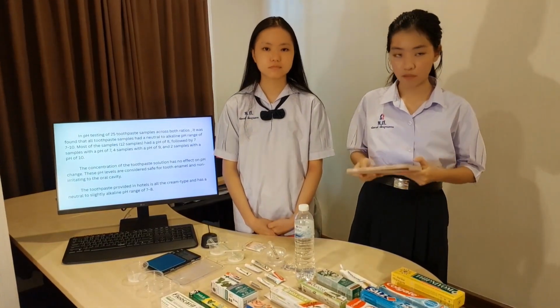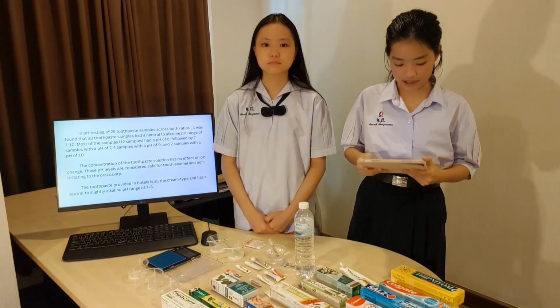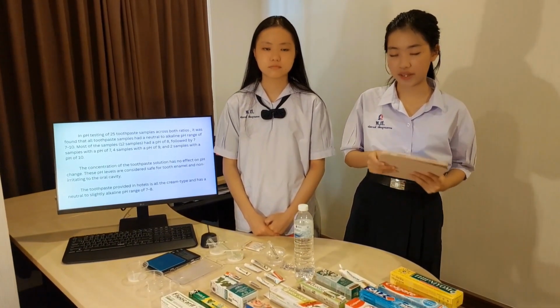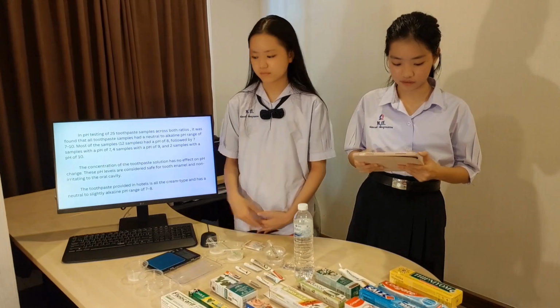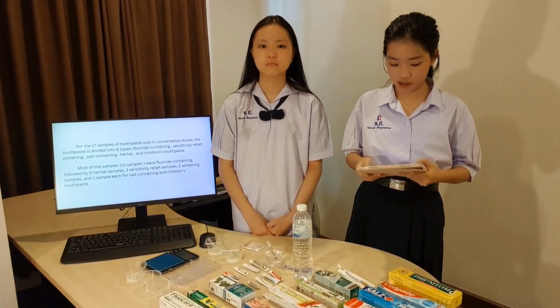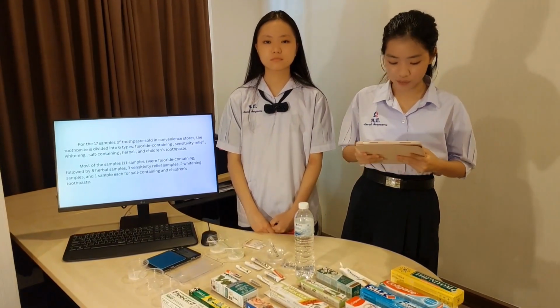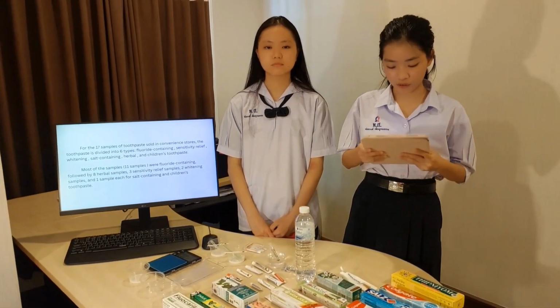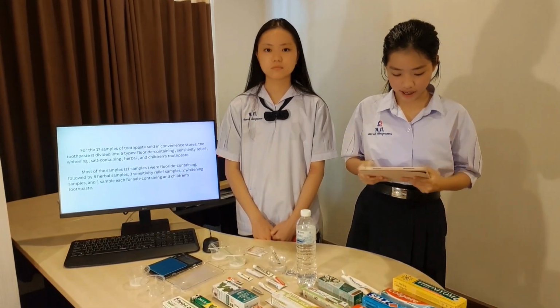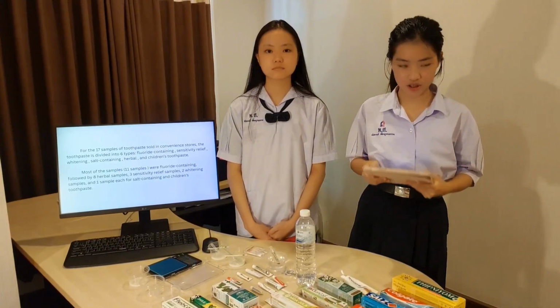The toothpaste provided in hotels is all cream type and has a neutral to slightly alkaline pH of 7 to 8. From the 17 samples of toothpaste sold in convenience stores, the toothpaste is divided into 6 types: fluoride containing, sensitivity relief, whitening, salt containing, herbal, and children's toothpaste.